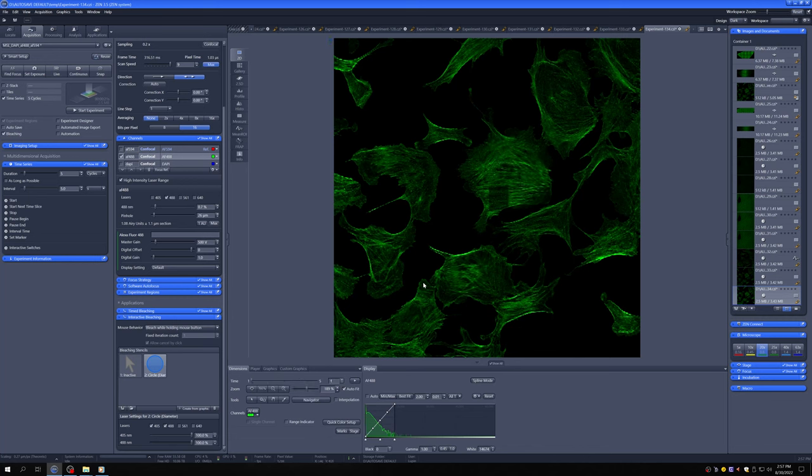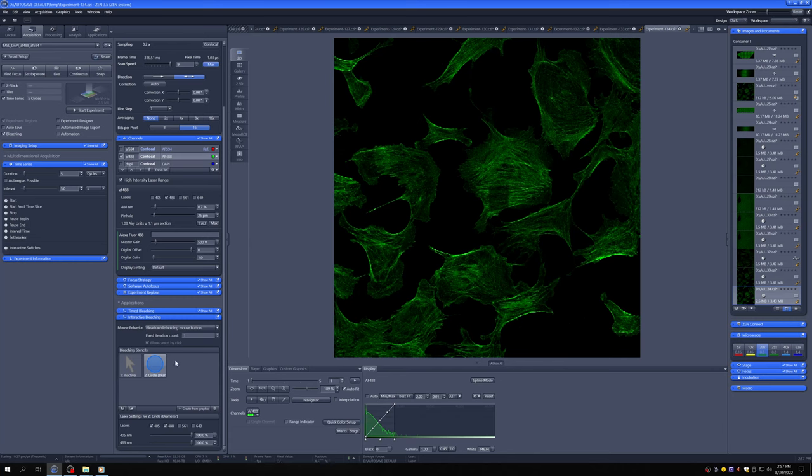Again, with the particular tool with that diameter that I created, you can obviously create other shapes and things to do it. So that's another way of doing bleaching that's interactive and it can be useful for some applications.